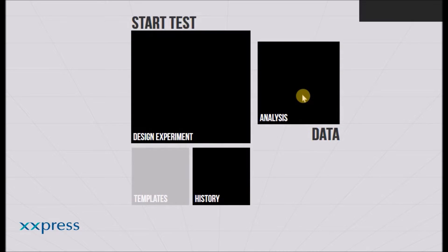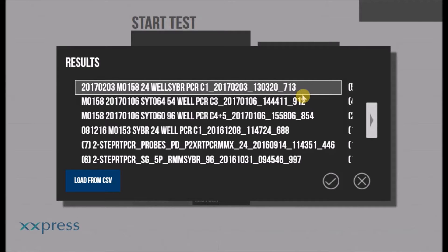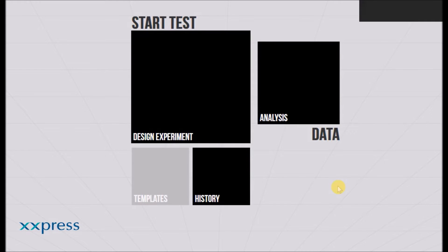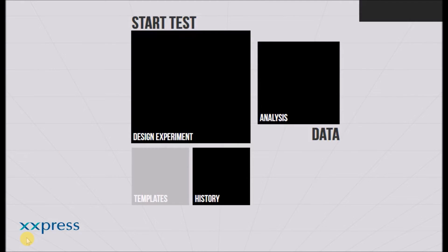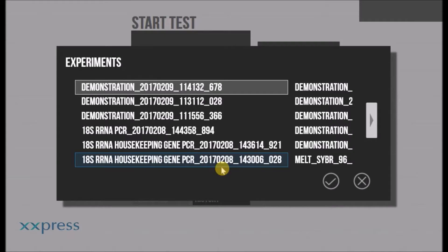In the analysis tab is a list of all the previous run results. Click on any of these to enter and view the results. The history tab lists all the previous run protocols performed on that machine. Click on any of these to load that particular protocol and use it again.